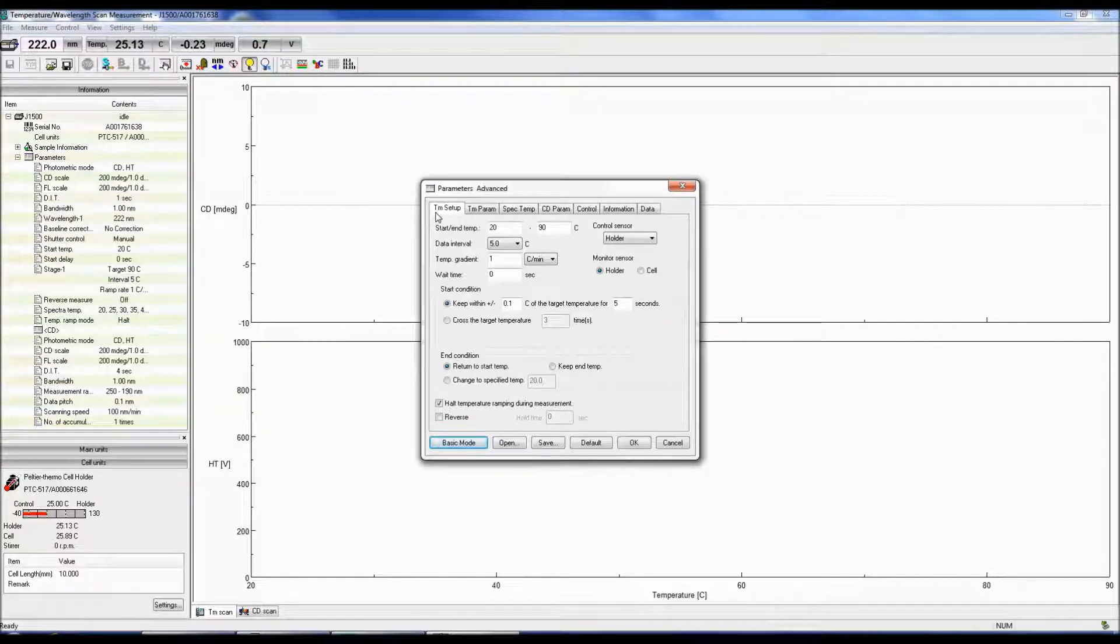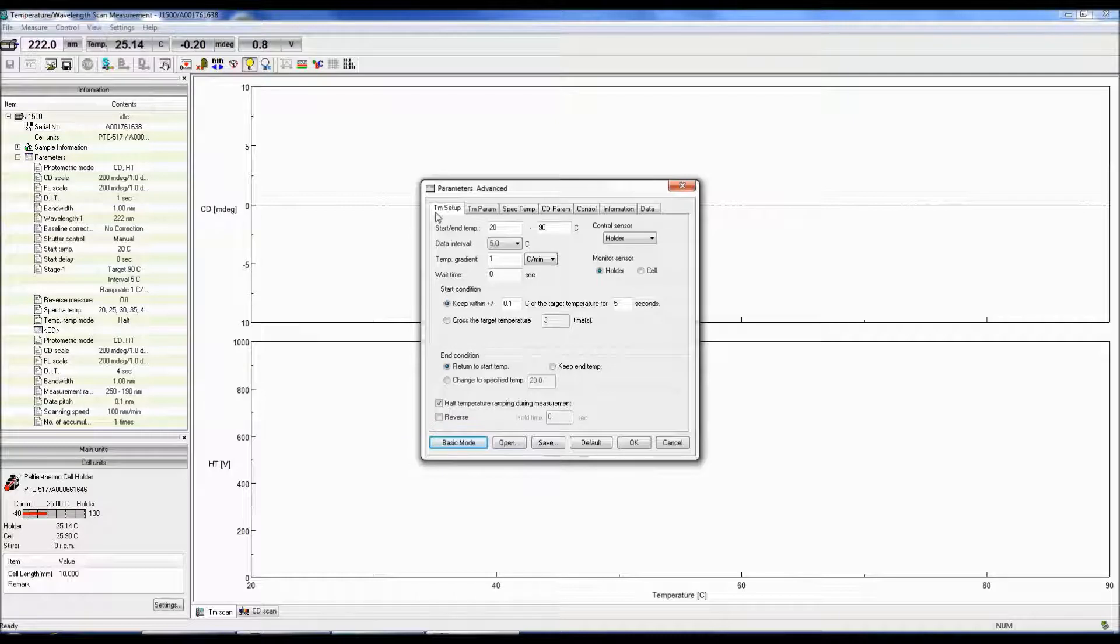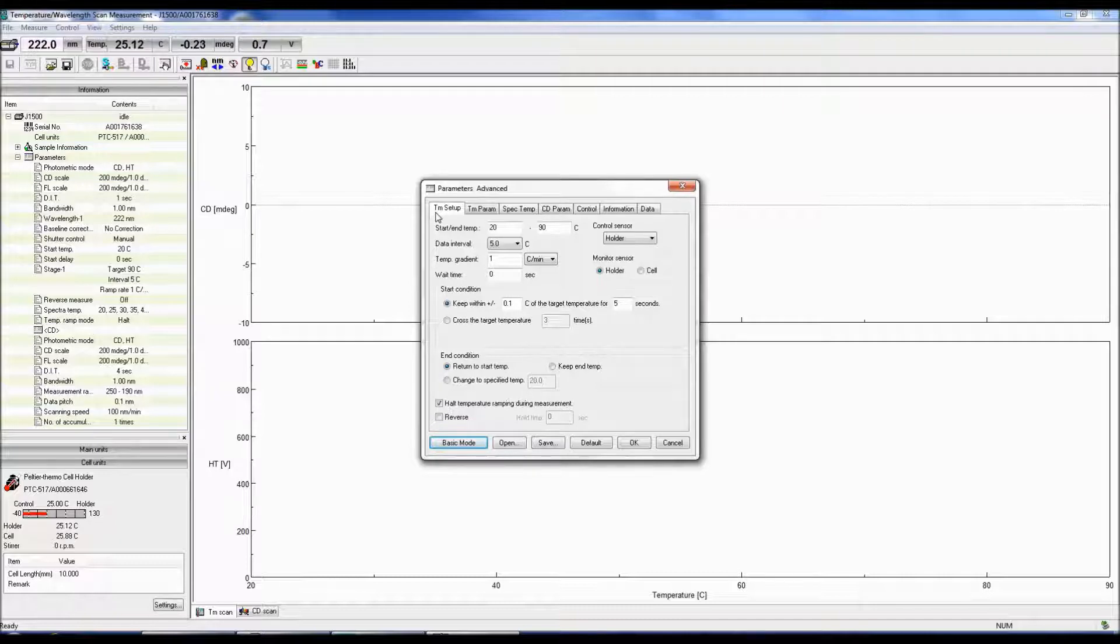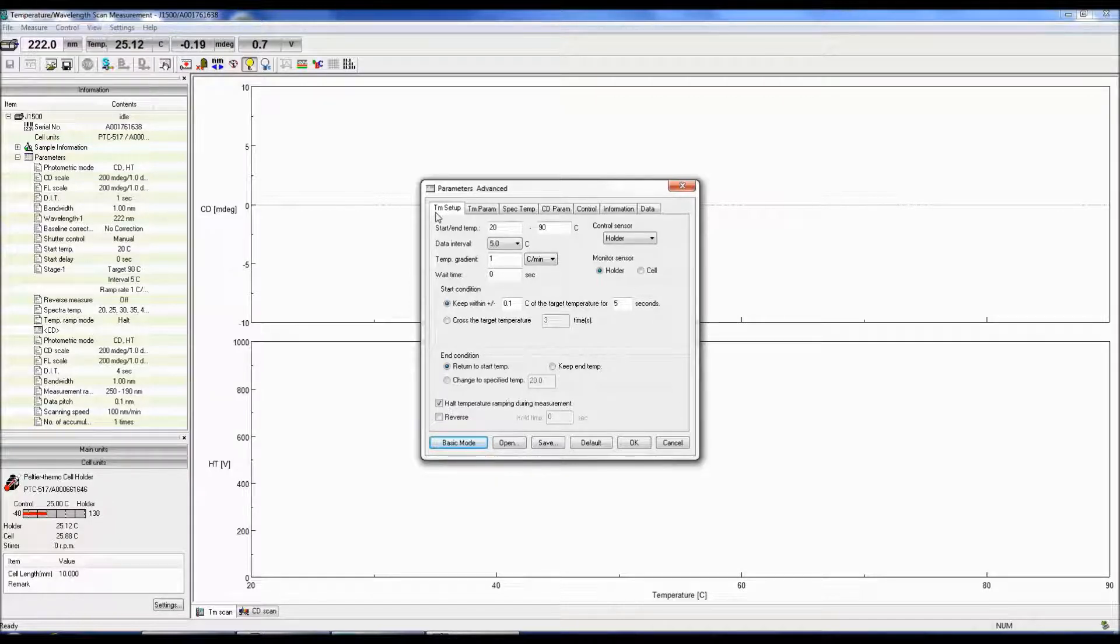This tab provides the temperature options for setting up a thermal melt. The Start-End Temp specifies the starting and ending temperatures of the measurement. Begin by choosing an ending temperature slightly above either the melting point or when the signal plateaus.